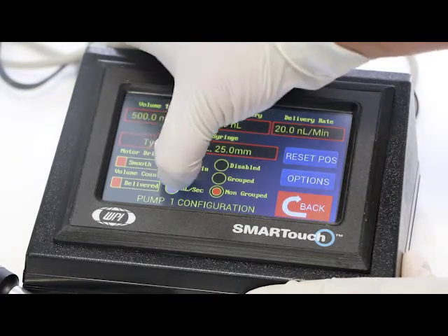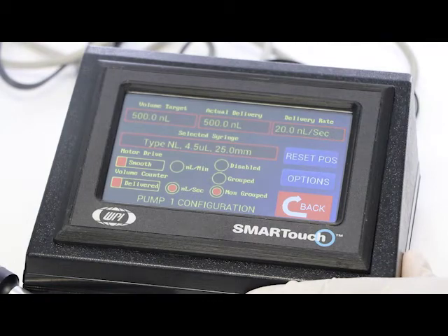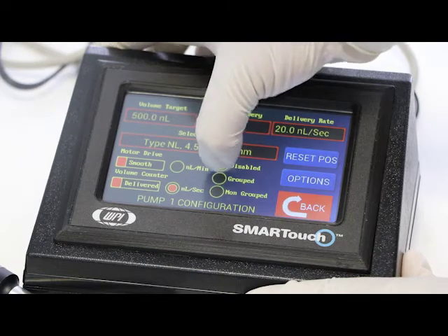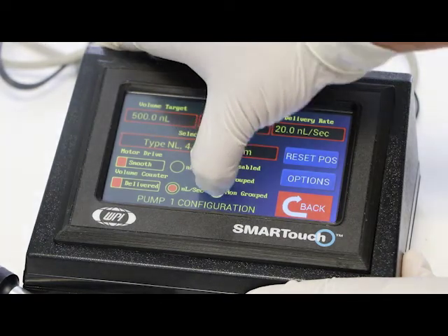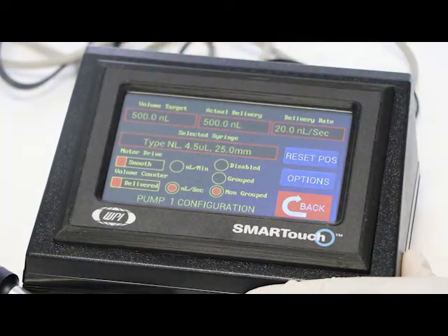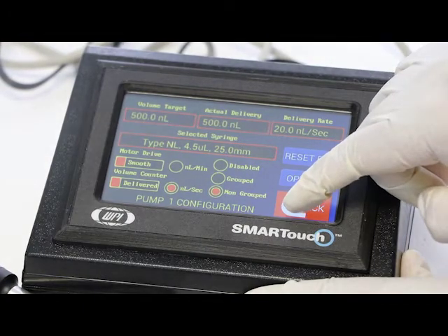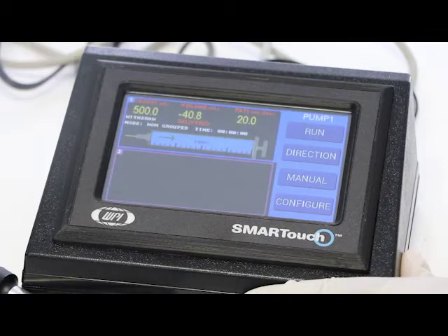You can just change it by just clicking on either button. And then if you have additional injectors, you can either group them together or have them non-grouped and they do individual rates and targets. Or you can just disable the whole function. And once you have the rate and the target that you want to inject, you can hit back and you're ready to inject.